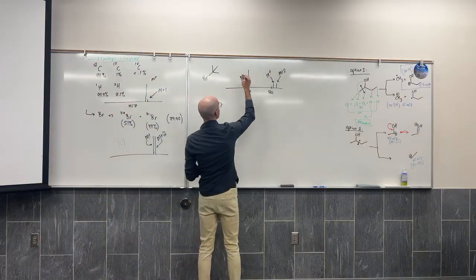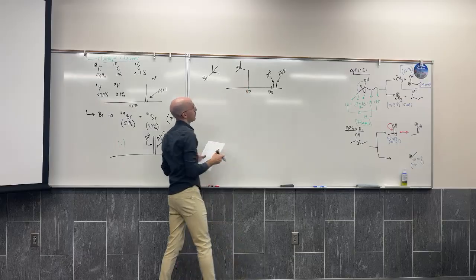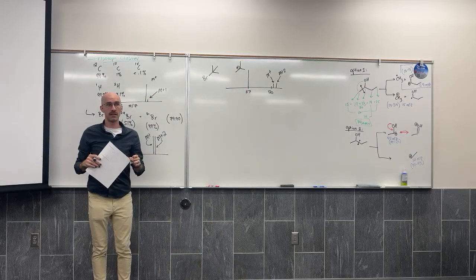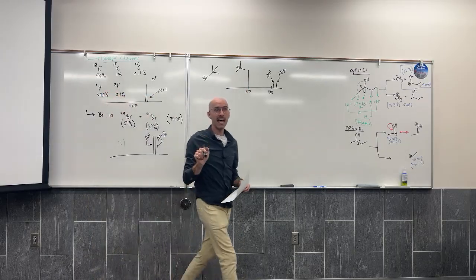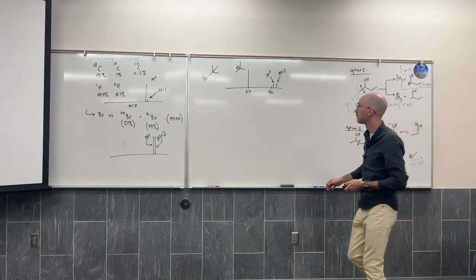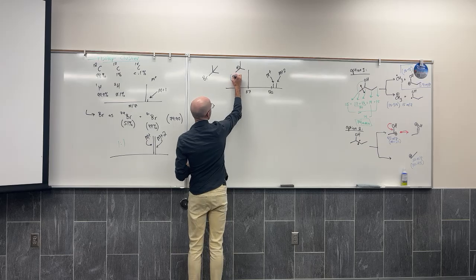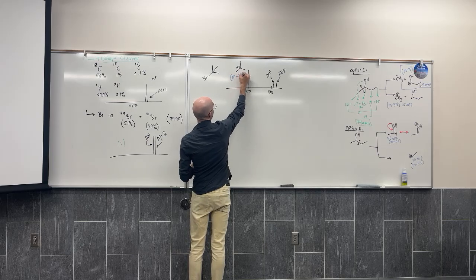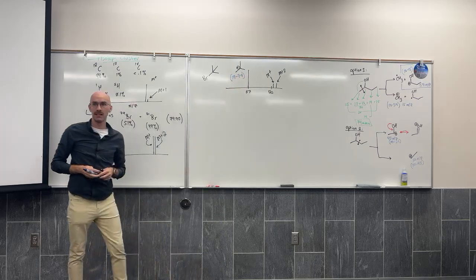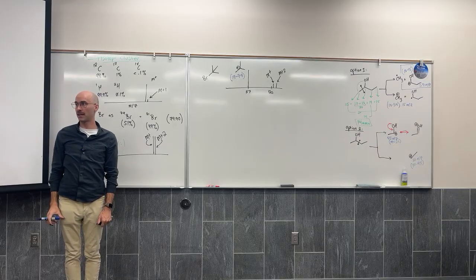It would make sense for that to be the tert-butyl cation, which has a mass of 57, and could be labeled as M minus what? M minus 79.